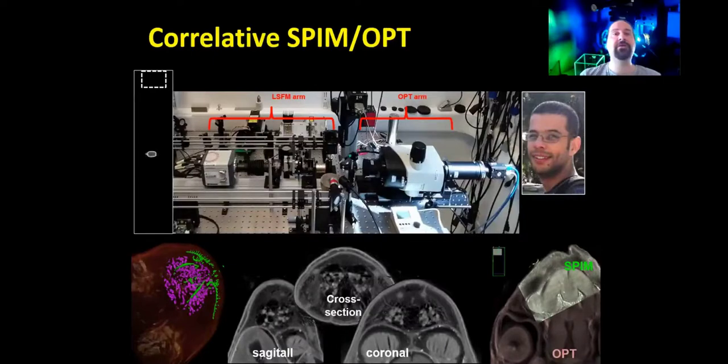For example, you can obtain an image of a whole animal, of a whole embryo during development using transmitted light, but then just focus on a specific group of cells that you're interested in, or an organ or a tissue that you can follow through fluorescence microscopy if you have a transgenic expressing just in your tissue or cells of interest. And that's what we've been working on now with the help of Ocean Globes, who recently joined the lab, by using this dual setup.